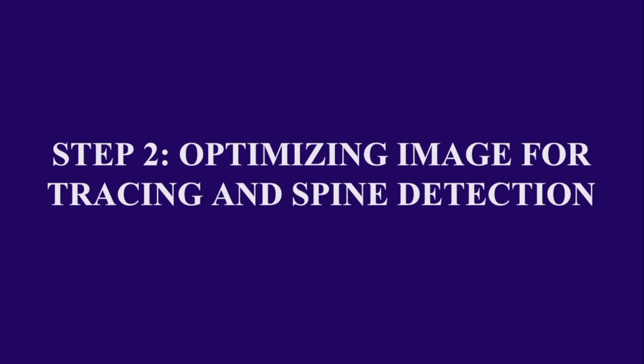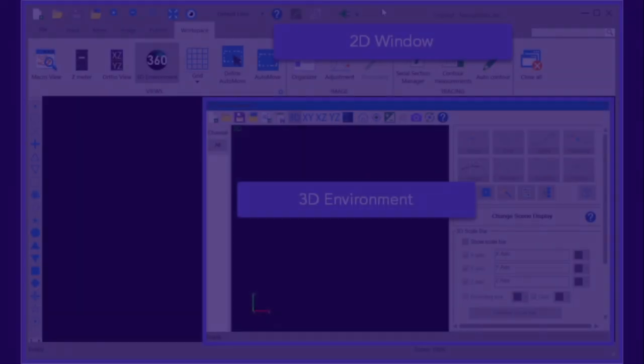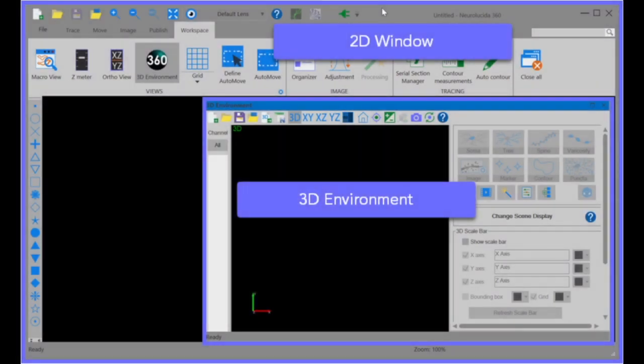Step 2 is to now optimize our three-dimensional image for tracing and spine detection. NeuroLucida360 has both a 2D window and a 3D environment. We will be using both for the duration of the program.